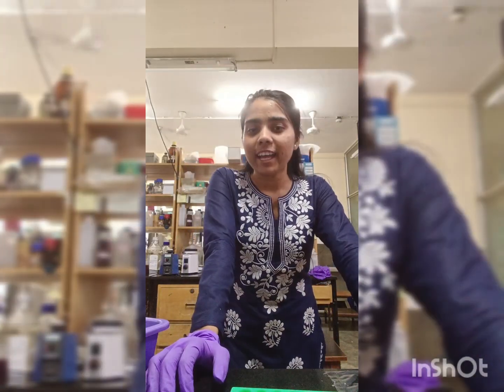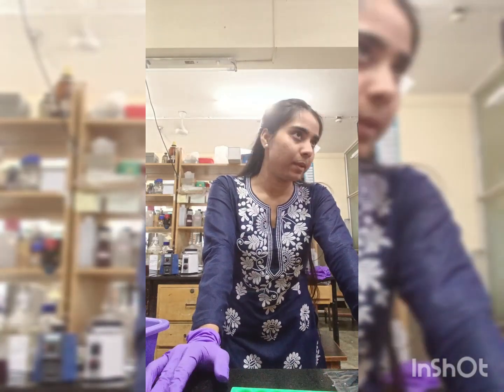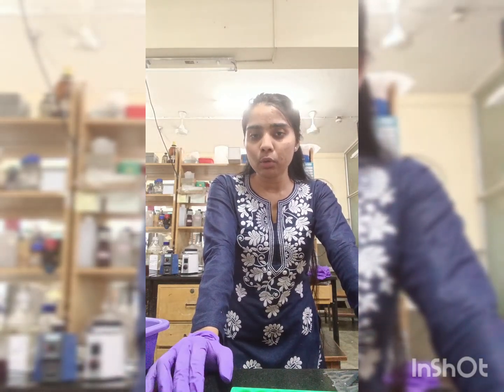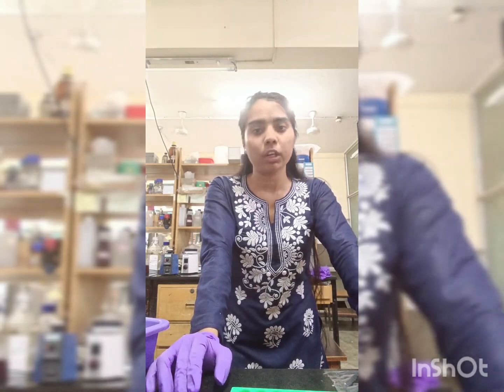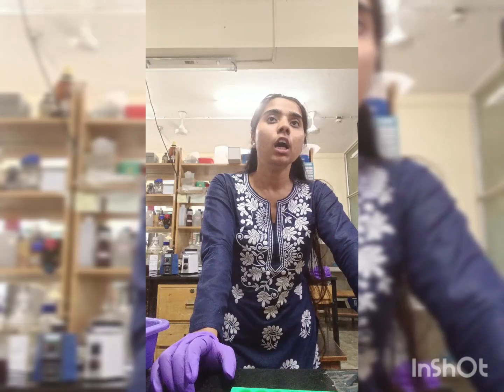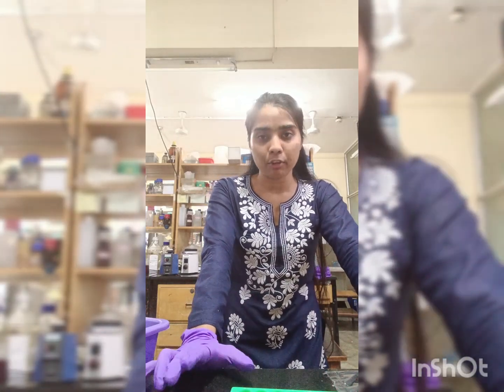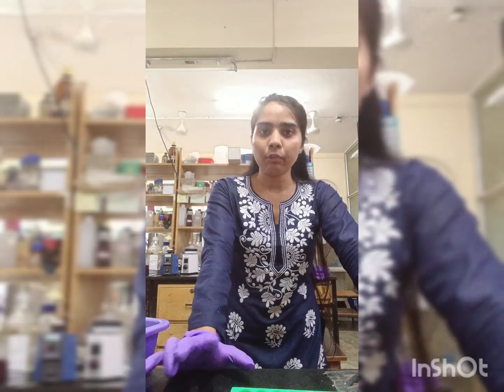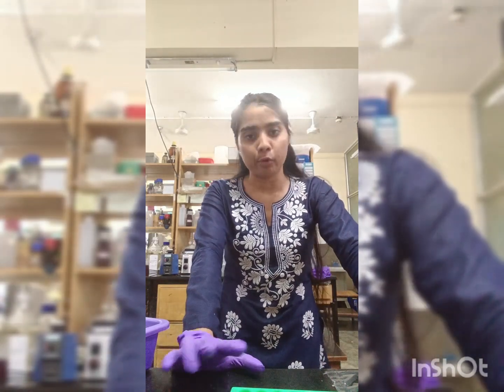Hello everyone, after a long time I am back on my YouTube channel where I will discuss one experiment. So today we will do one experiment where we can detect the protein concentration. There are multiple methods for detecting protein concentration, but today we will do the Bradford experiment, in which we will use Bradford reagent for the detection of protein. So stay tuned with me.